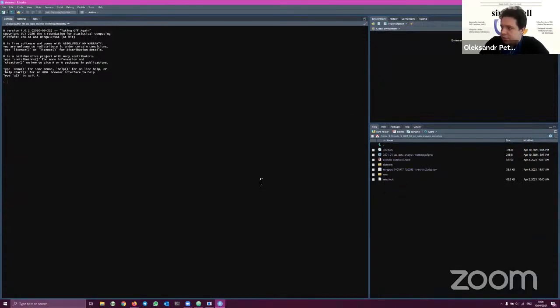What is also important is that you should open the script which we'll use today because we'll copy paste a lot from the script. So just for your convenience, I will send the link again to Zoom. But first I will add... okay, now I see the chat. So here is the link. Just keep it open because we will not upload this, but we will use quite a lot of this code.